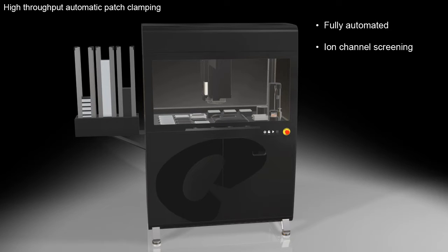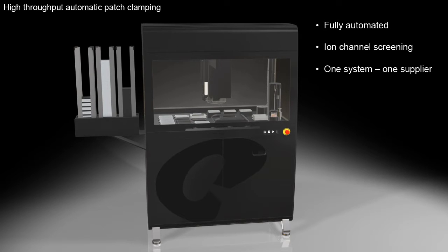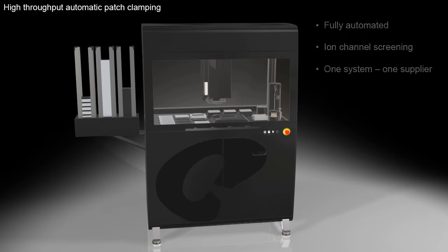Designed in a 384-well format, Cube bridges the gap between high-throughput and high-quality in ion channel screening and integrates more than 10 years of experience in automated patch clamp into one system.